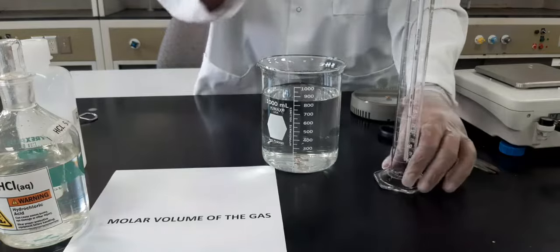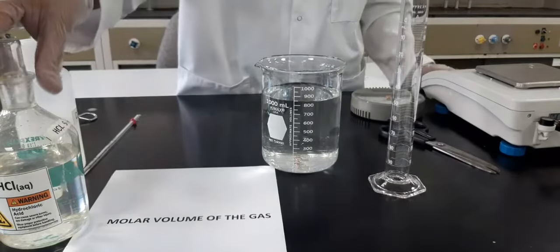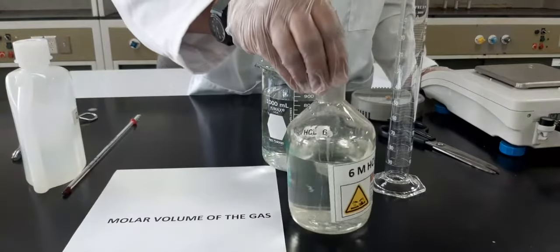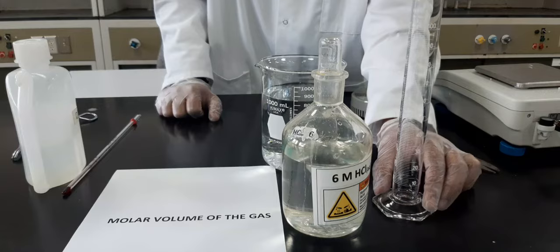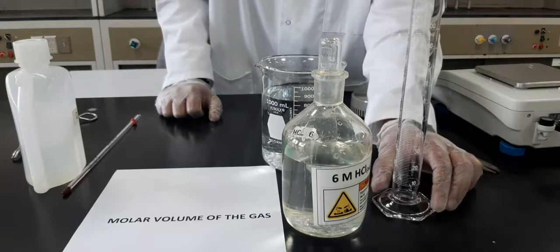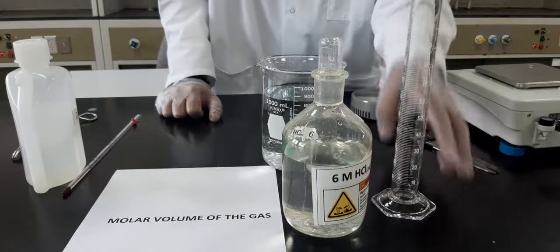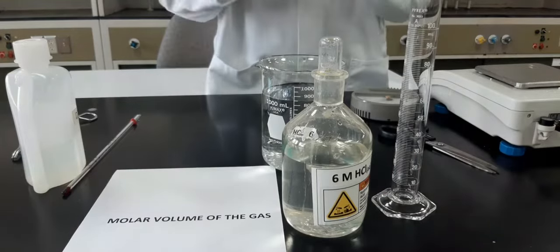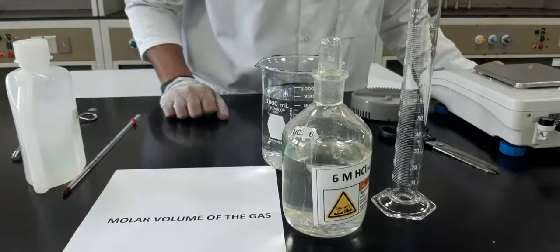The next thing you need to do is take almost 15 ml hydrochloric acid, which is 6 molar hydrochloric acid. You need to take 15 ml into the cylinder. Remember, even if it is 14, 16 or 17 ml, it's fine to use that.